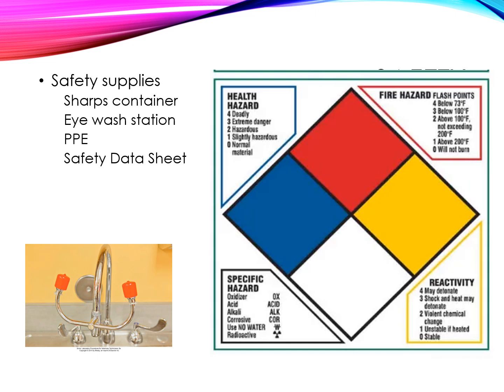And then eye wash stations are required by OSHA. We do deal with a lot of chemicals, and gloves are very, very important. Make sure you guys are always wearing your gloves so you can protect yourself from certain zoonotic things like leptospirosis or mange, for example. And then also be aware of your safety data sheets.